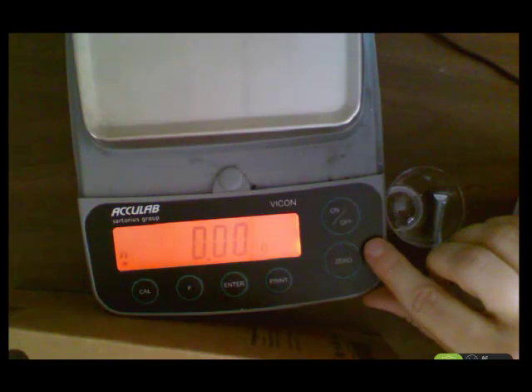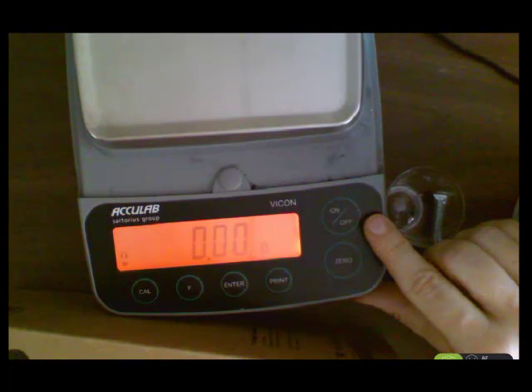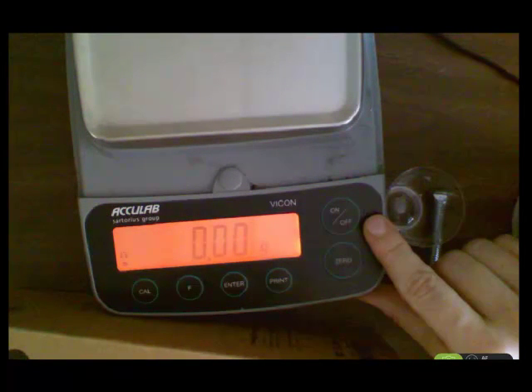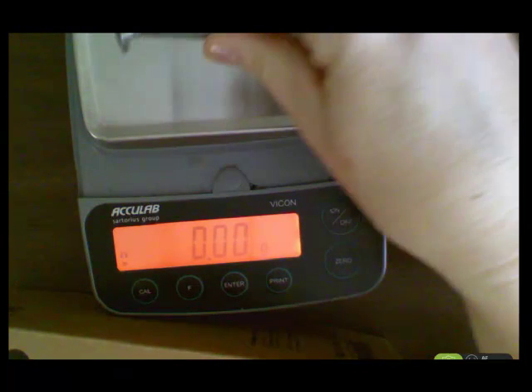Now, before you do anything, you want to zero the balance. So there's a button here that says 0. So you press that, and then you wait, and it will reset to 0. Now, let's say I wanted to measure the mass of this bolt. So I just place that on the pan.